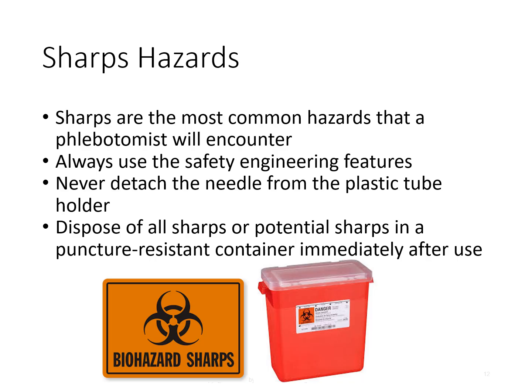potential sharps in a puncture-resistant container immediately after use. If you look at the screen, the bottom right picture, that red container is actually a sharps container. It's kind of like a thicker plastic, and that basically protects yourself, housekeeping, patients, other healthcare people, visitors. It protects everybody from the sharps, basically. So it reduces that risk of people getting stuck by a needle.